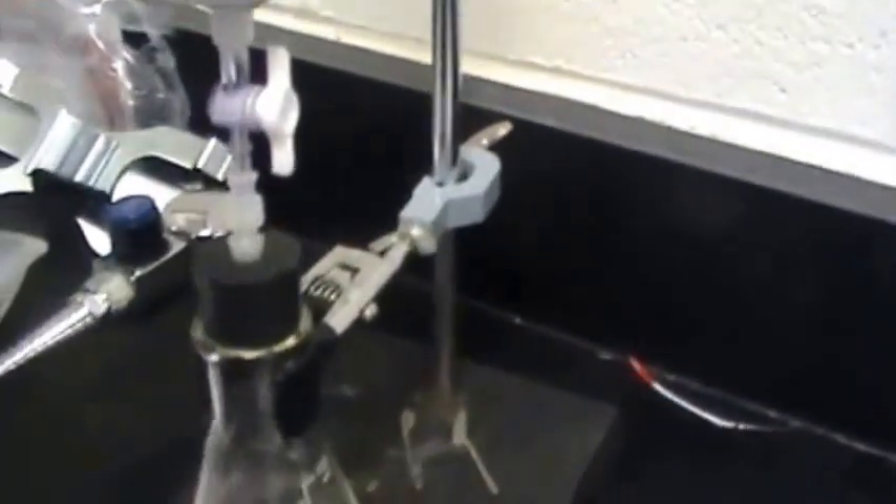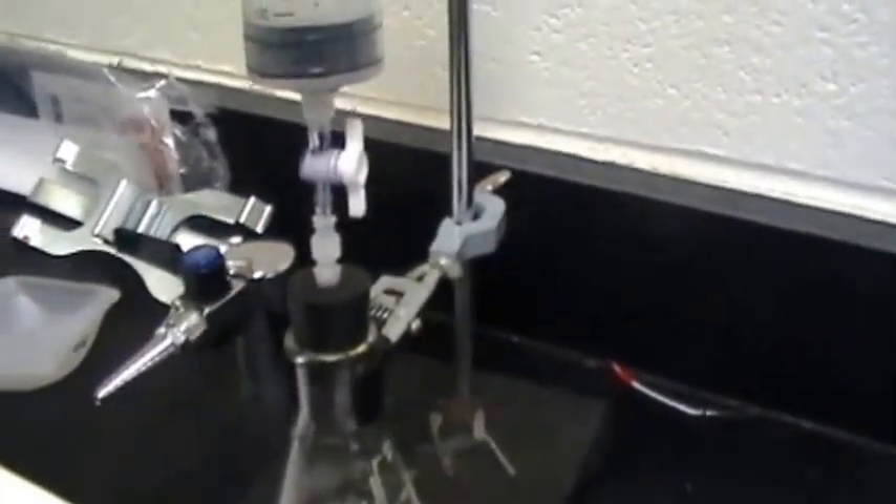It'll lift the syringe. Because our stopclock is open — make sure it's open, that's very important.